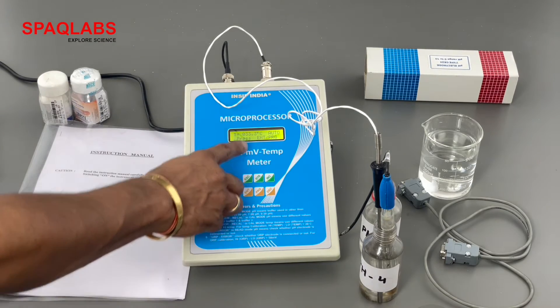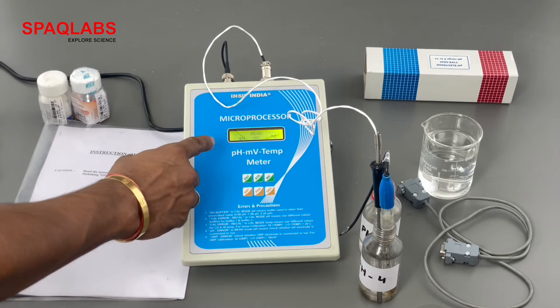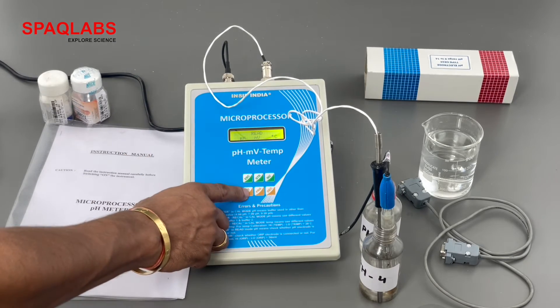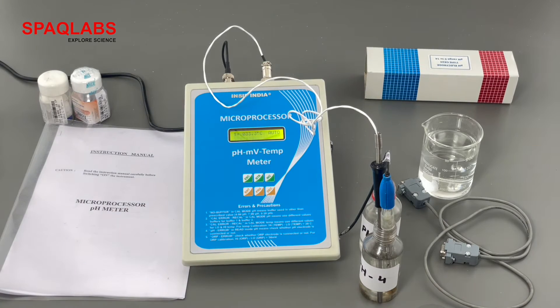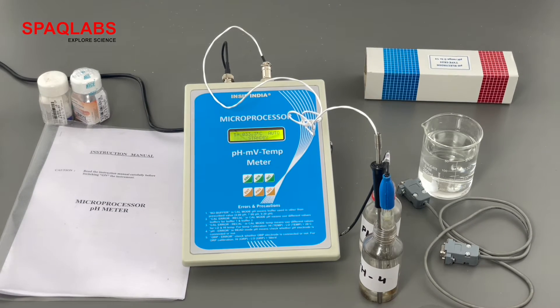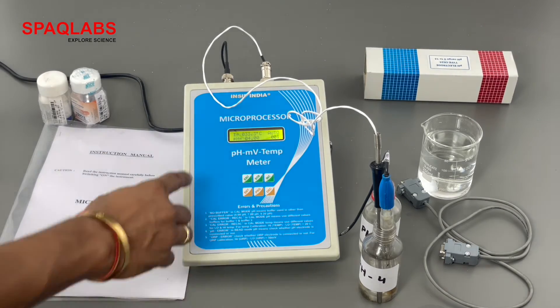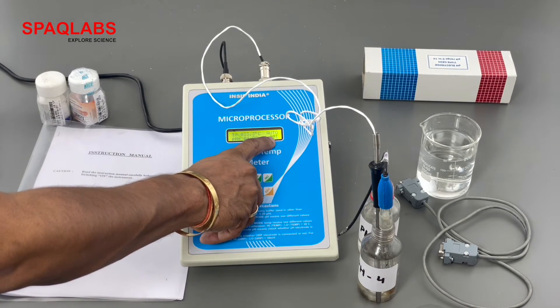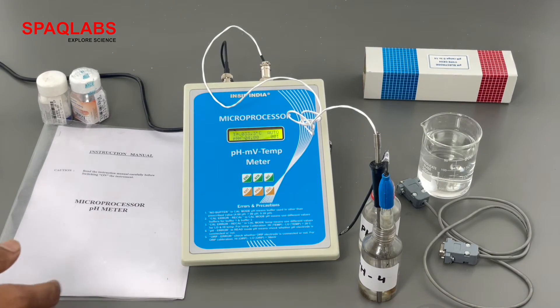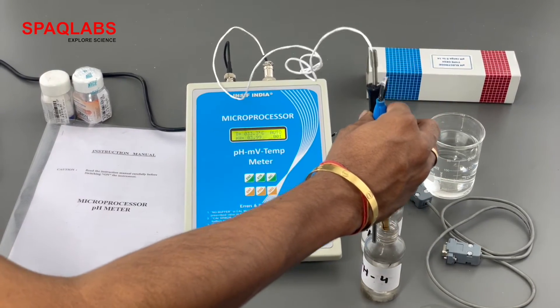Now if we press enter it shows 'read', whereas earlier it was showing 'calibrate'. Now let's select pH — it is already selected. Press enter. This solution was calibrated at pH 4, so when we read it with this pH meter it is showing 4. Notice there is also a digit displayed — 001 — which is the memory location where you can store the data of your sample.